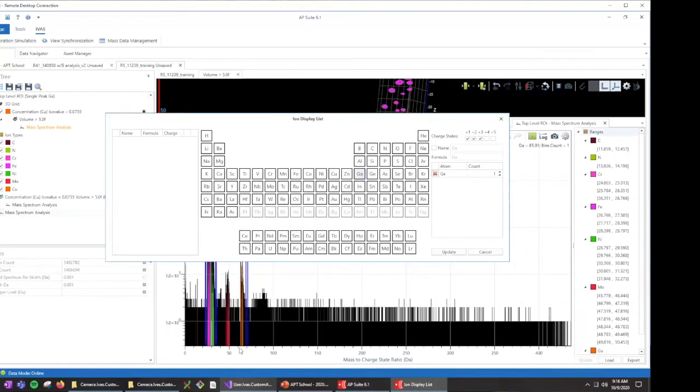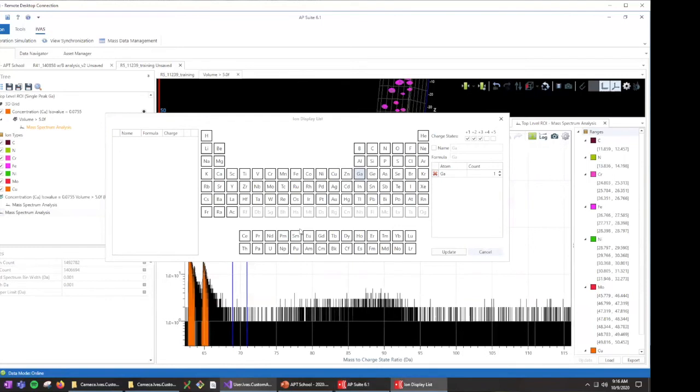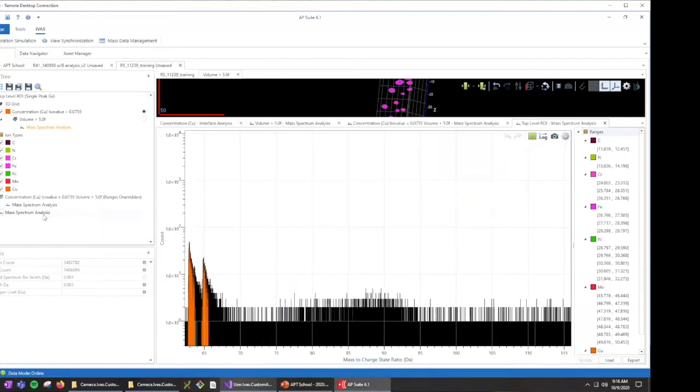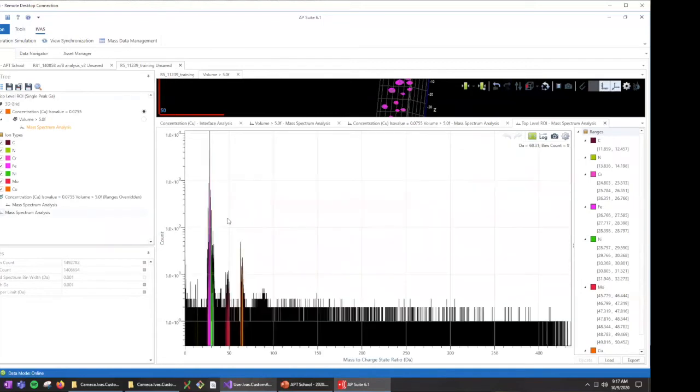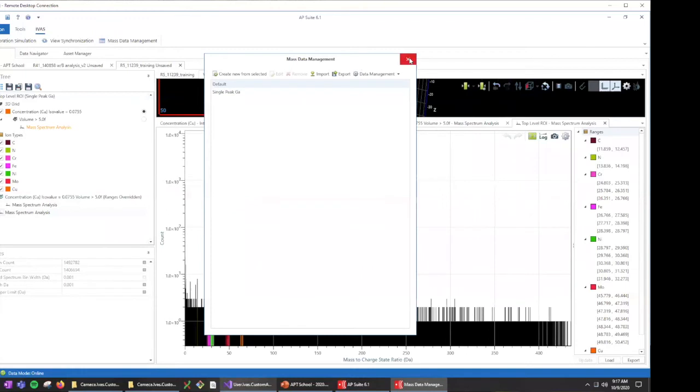Yeah, doesn't work in this particular view. Let's try the ID view. Well, clearly I have to fix a bug there. This is what you get when I'm using totally pre-release software here. We make a note. All right, so yeah, we do have the ability to have different tables here.